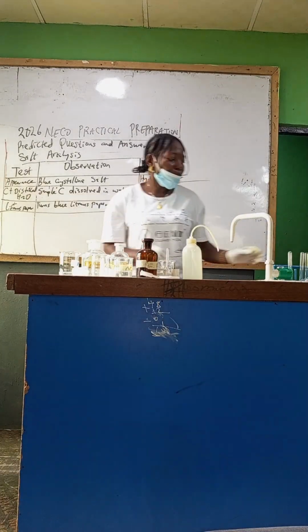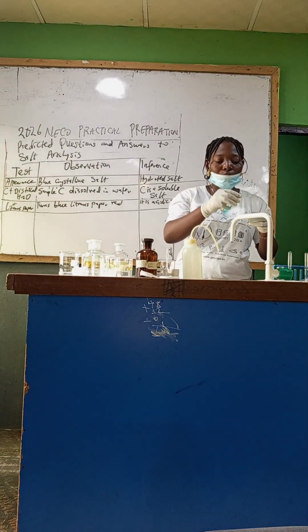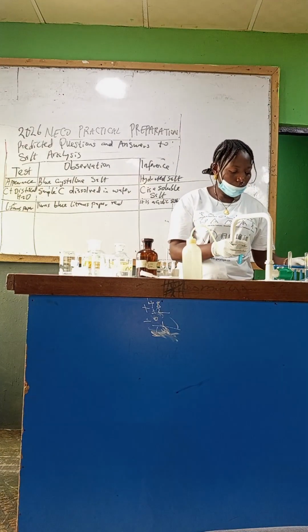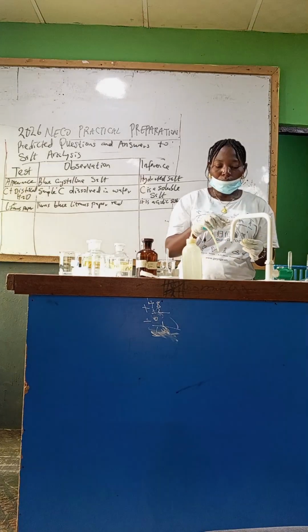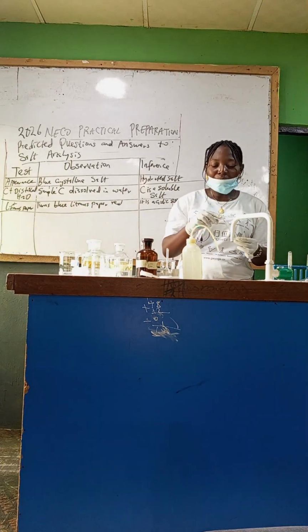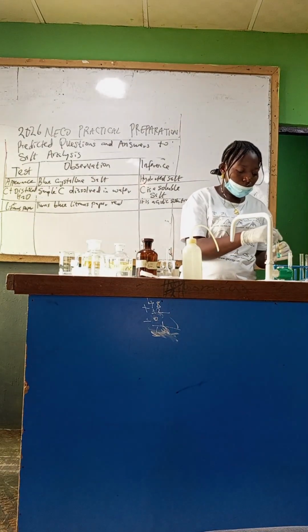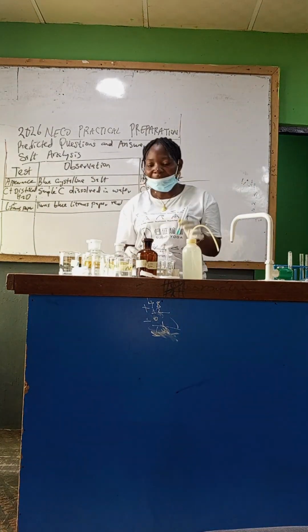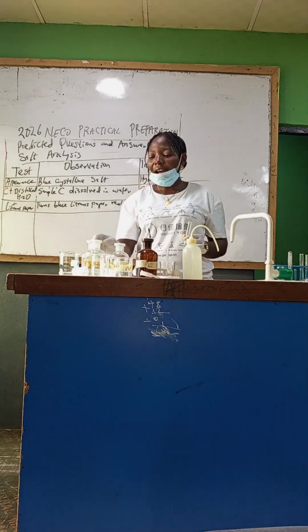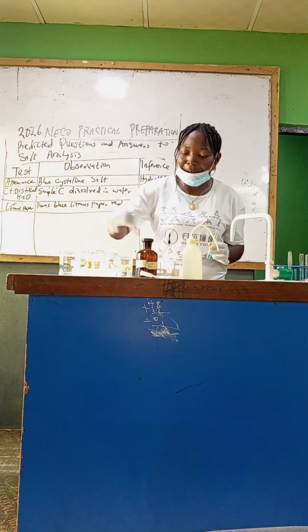Then the next one says divide into 3 portions. First portion plus sodium hydroxide in drop and in excess.